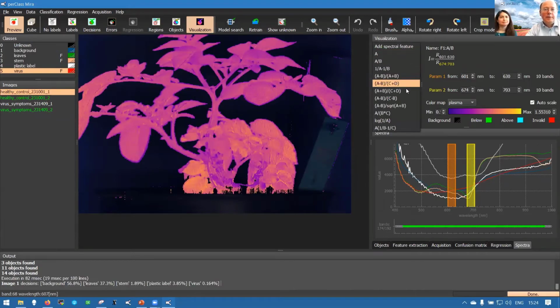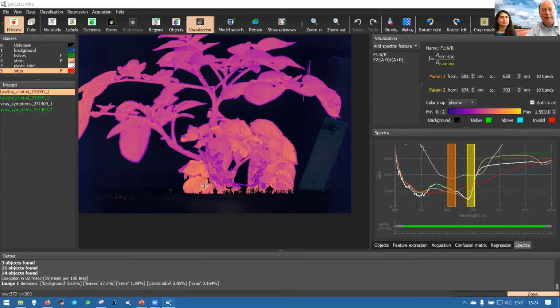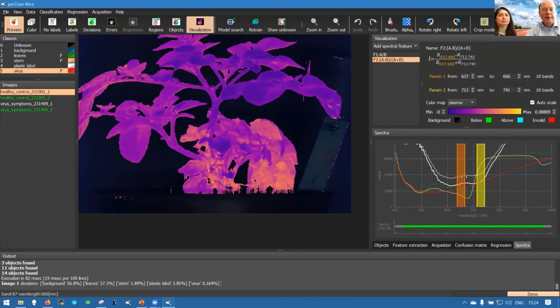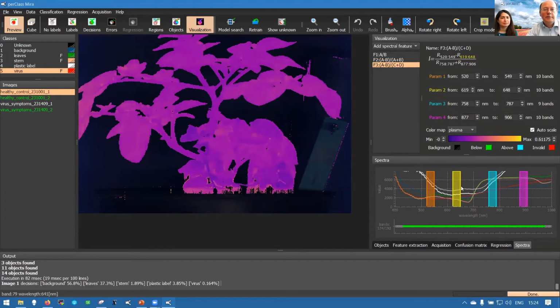So you can see that the equations allow you to define many different common spectral indices like NDVIs, all these different things, or many of the things that are published in the literature. You can play with this, each of them with the parameters. You can change the spectral ranges. We can use indices that have up to 4 parameters. So that gives us quite some opportunities.